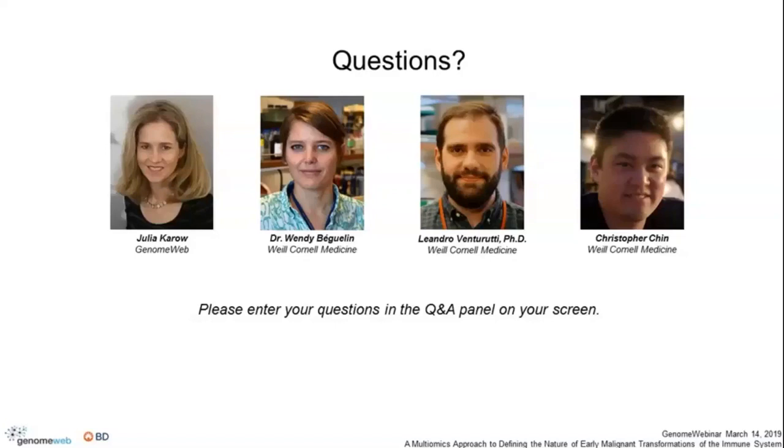I don't know, Chris, if you have anything else to add here, as you've been working a lot with the software. I can't say anything. You've covered pretty much everything there. I would say that the data viewer is very easy to use and very intuitive, which is really nice. And the output files from the viewer and from the Rhapsody pipeline going into R or any other analysis software is very straightforward. Okay, thank you.